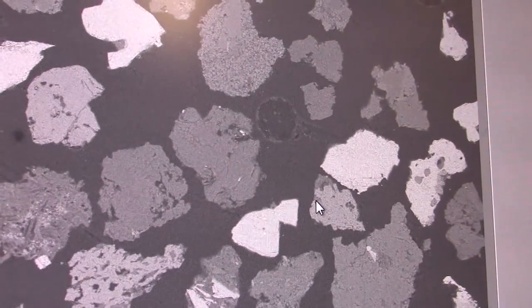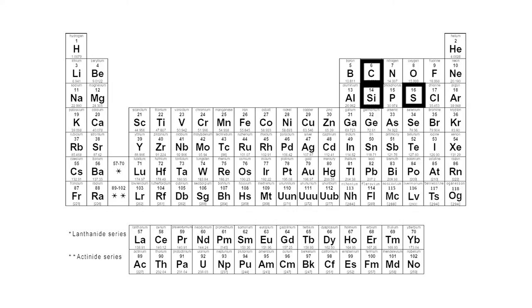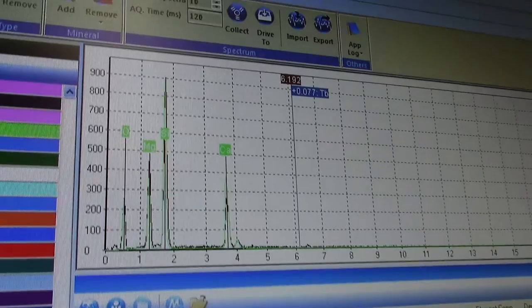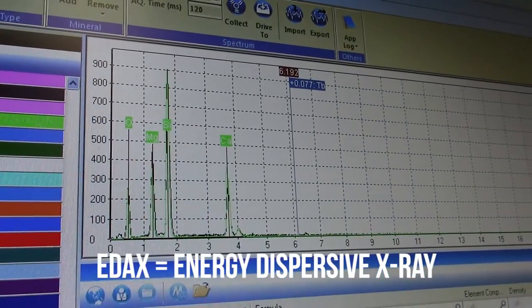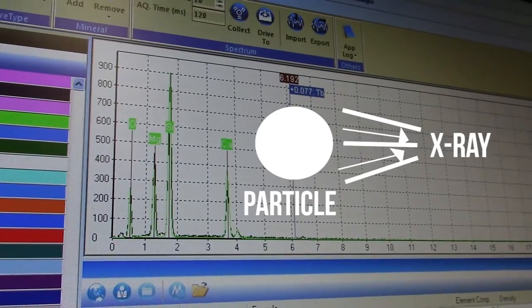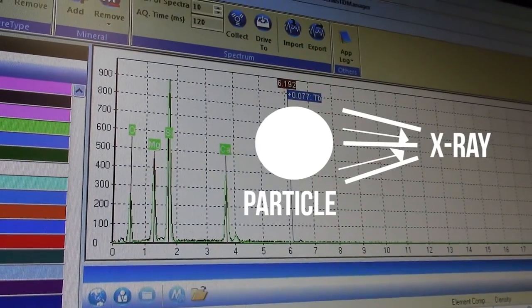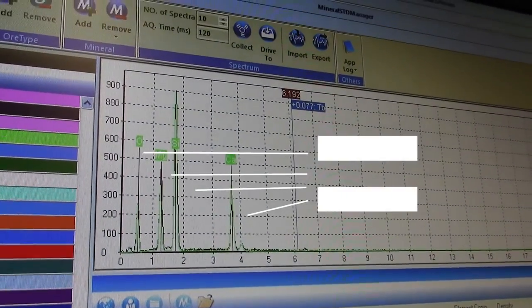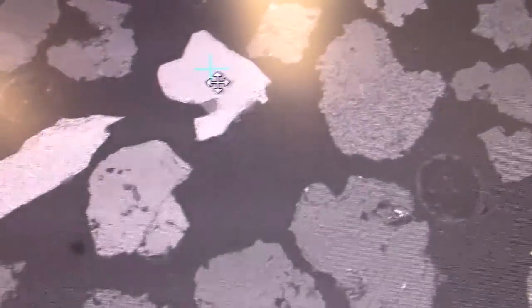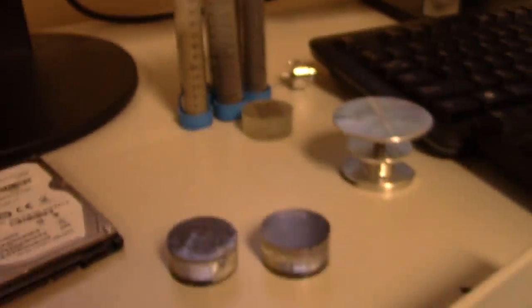This is the EDAX, which is energy dispersive x-ray. It's x-rays hitting that particle, bouncing back, and causing spikes for certain elements contained in it. We selected another particle from the sample.